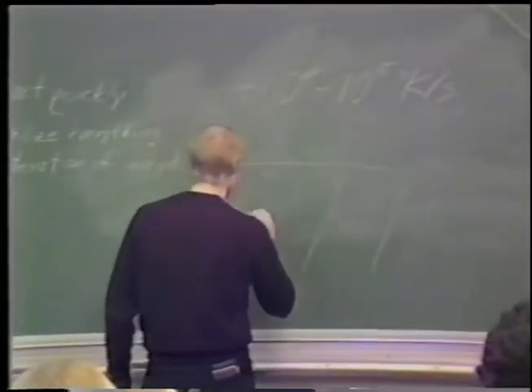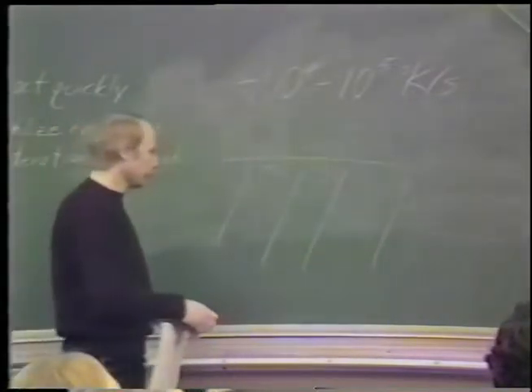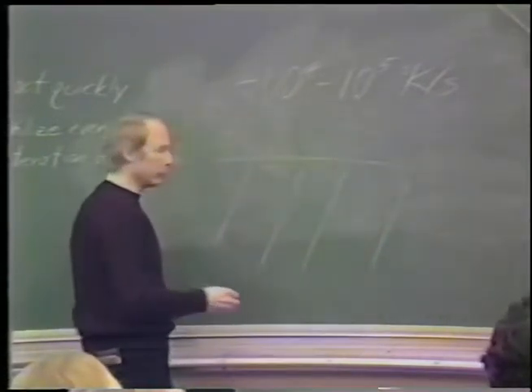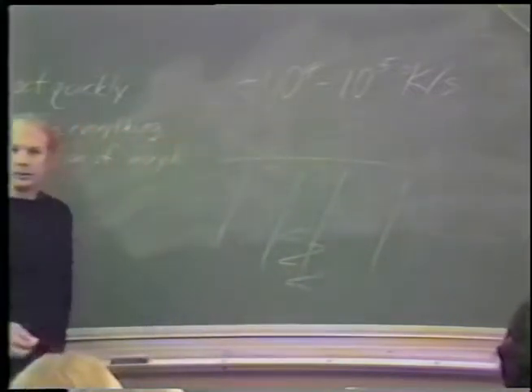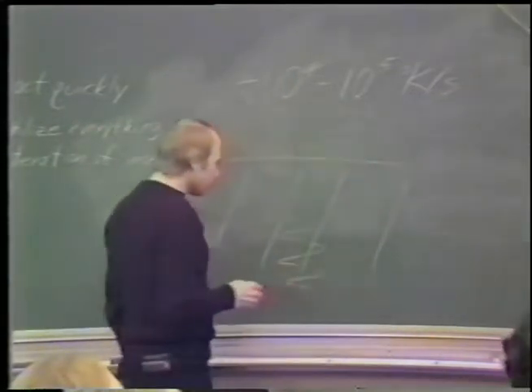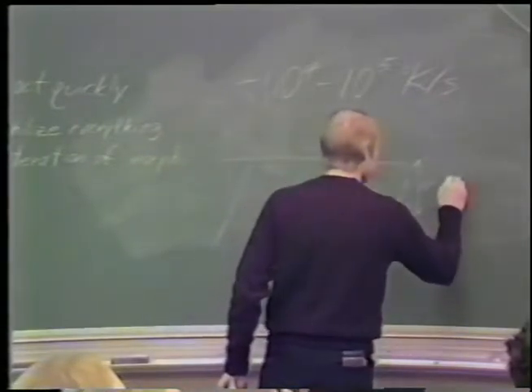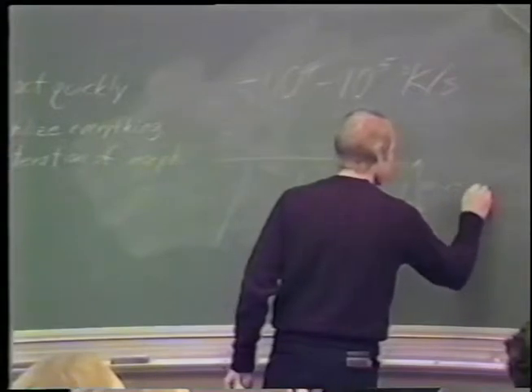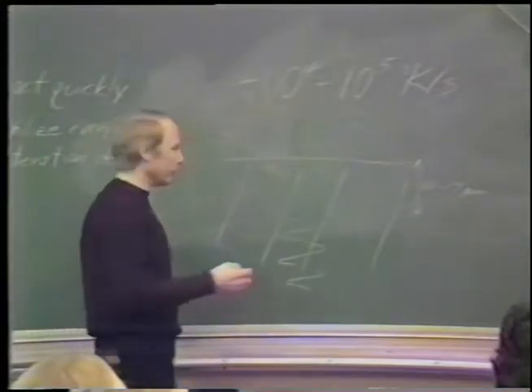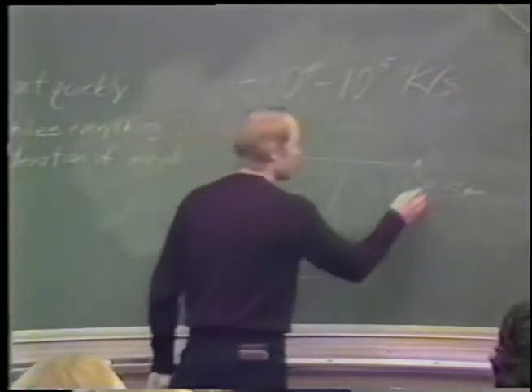And let's say that that's at this level, at which nucleation begins before the temperature of homogeneous nucleation is reached. Once nucleation has occurred and ice crystals begin to grow in this region, the heat of fusion will be liberated, and that will even further slow the rate of heat extraction from regions deeper than this point. And in general, this depth is 10, 15 micrometers under the best conditions. If things are really optimal, sometimes you get to 20, a little more. But it's usually more toward the 10 side.